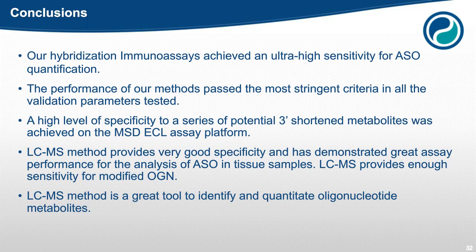The LC-mass method provides very good specificity and has demonstrated a great assay performance for the analysis of ASO in tissue samples. It provides sufficient sensitivity for modified oligonucleotides, and it's a great tool to identify and quantitate oligonucleotide metabolites.